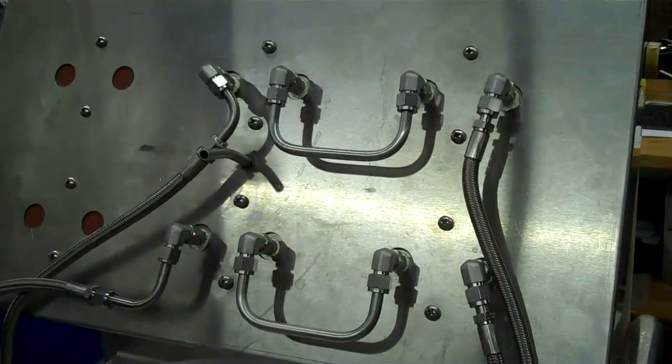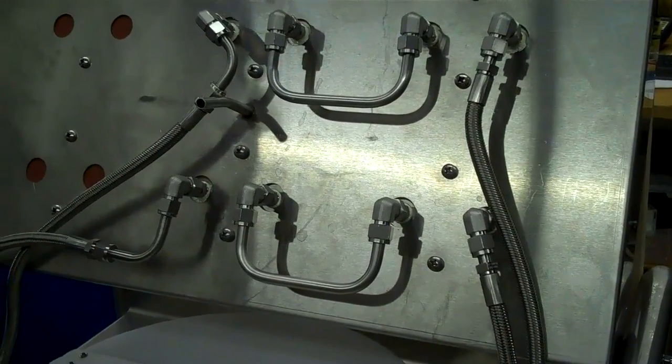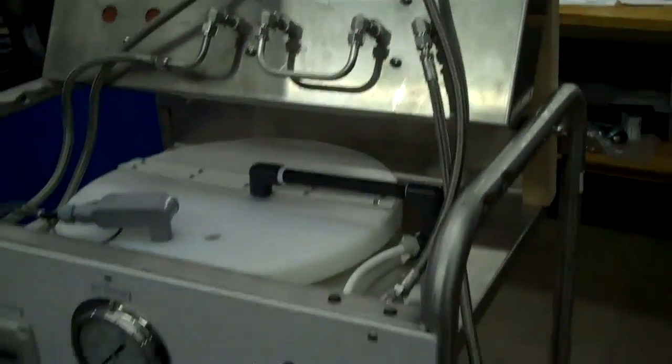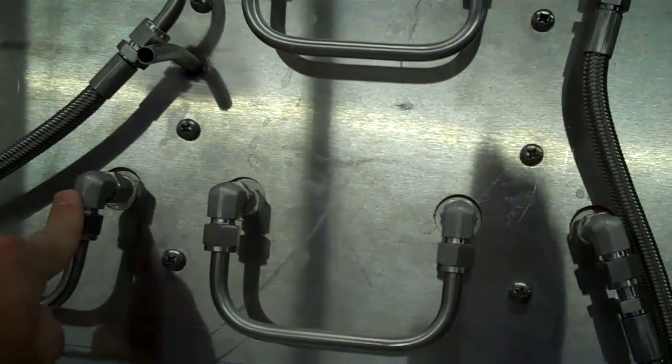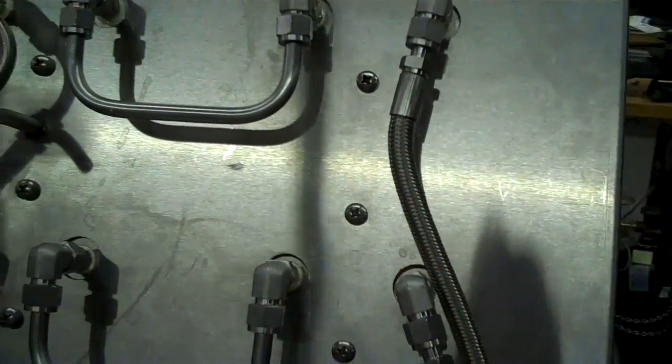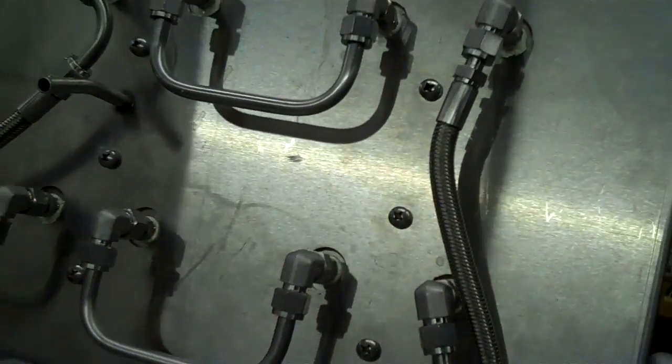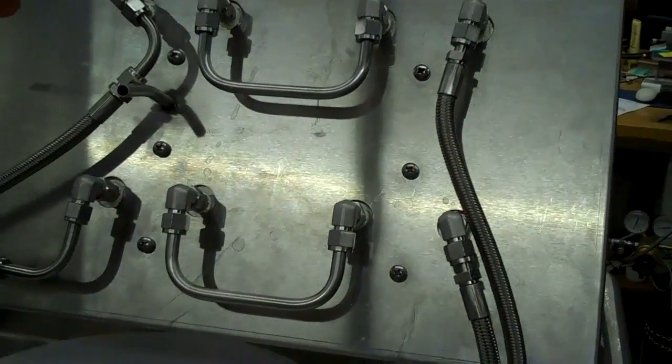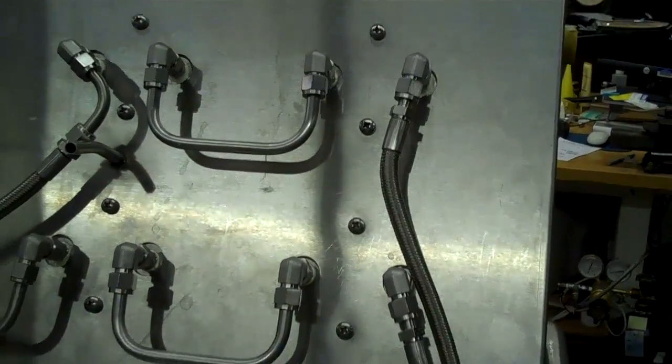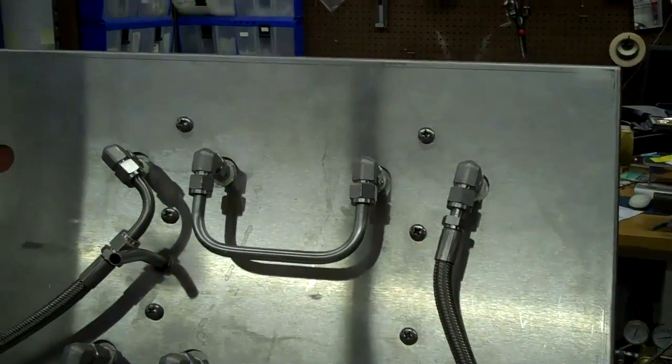Here's the internal configurations of the bottom. The top has been lifted up. You can see the tank on the inside there. Basically you have inflow through here, runs through the cell, back out and then goes back through to the concentrate control valve which is the brine valve that's on the front. You can see the same thing in the other line.